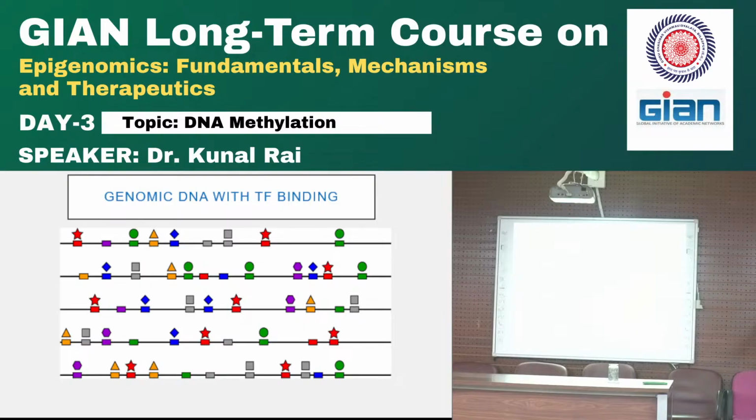You reverse cross-link it. I forgot to tell you about reverse cross-linking too, because I forgot to tell you about cross-linking. I actually didn't forget, that was intentional. I didn't want to confuse you, okay? Basically, immunoprecipitation and washes, and then proteinase K digestion and reverse cross-linking. So now I've got just my DNA piece, okay?